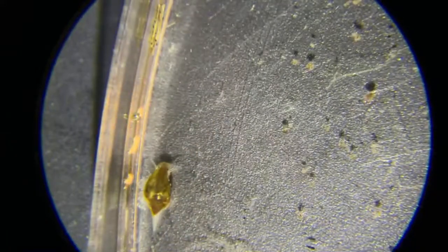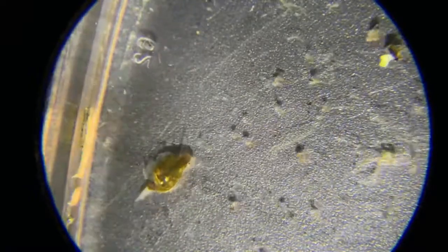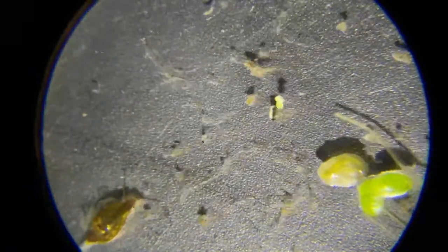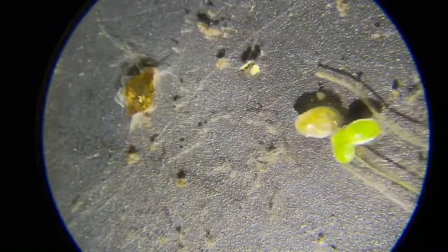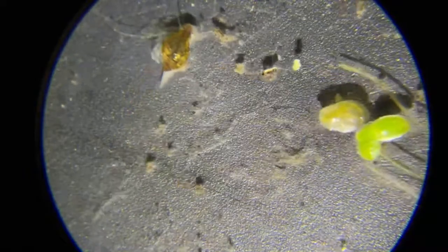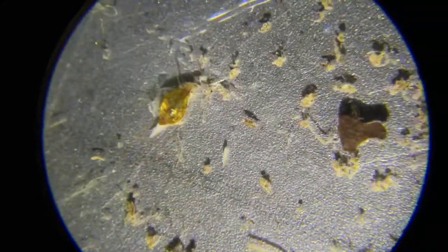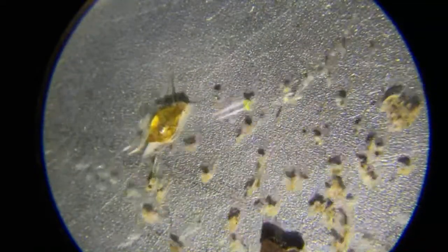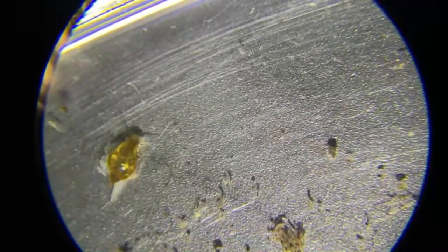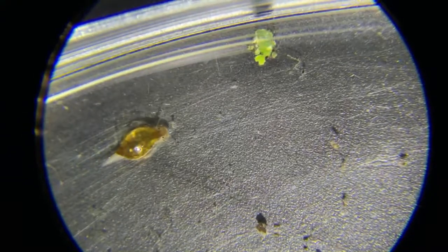Yeah, gingerbread, if you've been around me, you know that I stream paramecium all the time and they look giant through my regular microscope. But look how they look. This is 15x right here. So even at 15 times, that's how small they are. They are really tiny. And you would think, well, I can see them next to the snail, I should be able to see them with the naked eye, but you can't. The normal person's eye can't resolve that small.